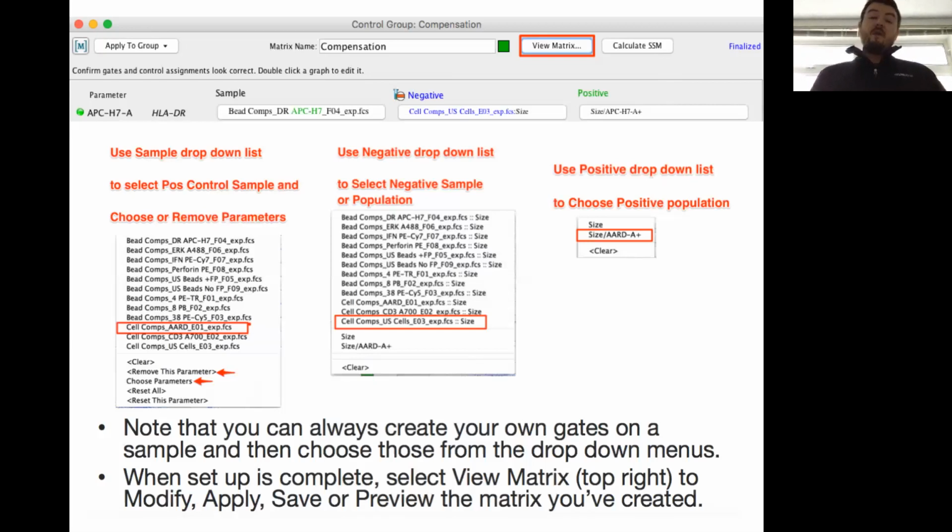Once you've closed the wizard, FlowJo is not going to save those assignments. And if you reopen the wizard, it will perform the auto assignment again. And so sometimes that can be desirable if you just want to start from scratch, but frequently users can be frustrated by that. So just be careful that you're not closing the compensation wizard until you're done with your compensation.